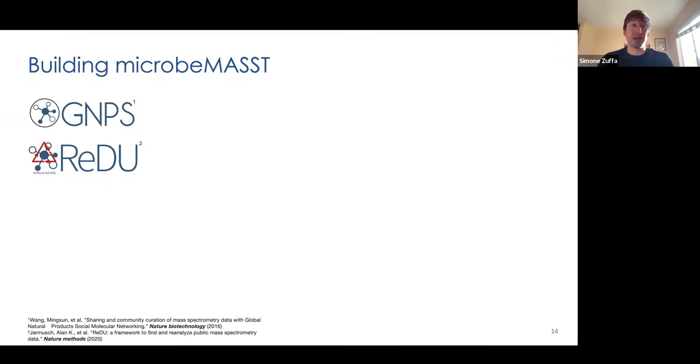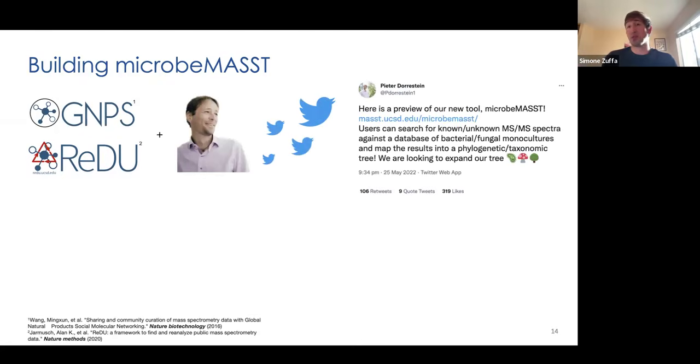We curated data manually, but also through ReDU, another tool developed in our lab, which allows users to associate controlled vocabulary metadata to their samples. Then we turned to Pieter, our in-house Twitter star, to ask the community to deposit even more data. And the response was astonishing.